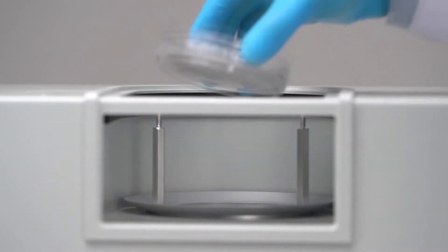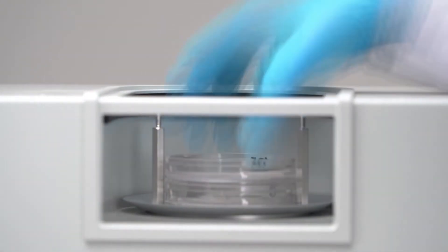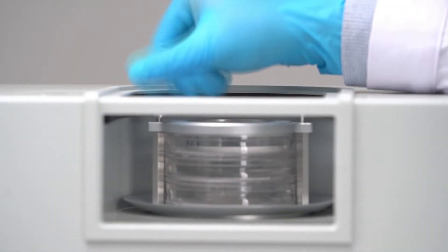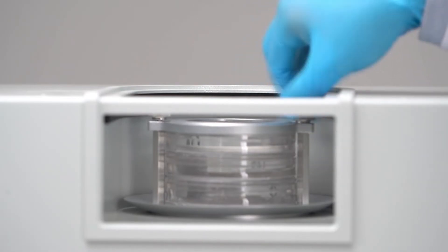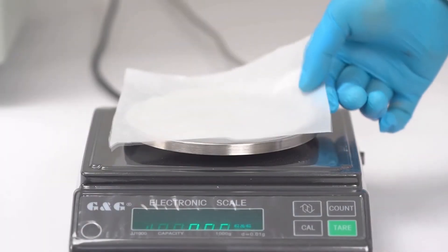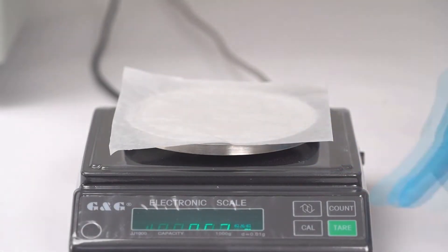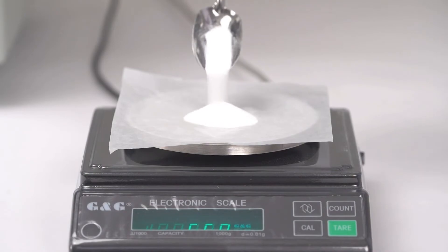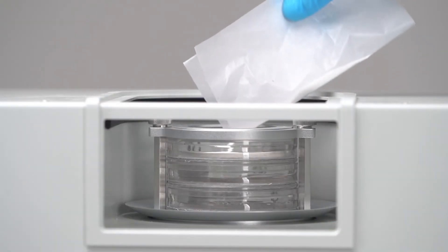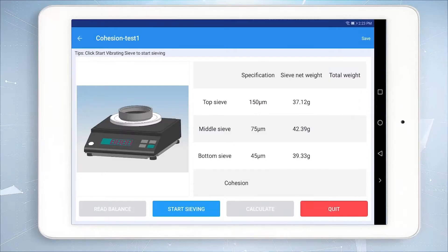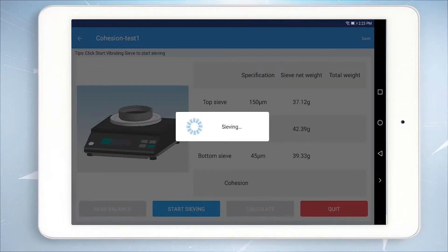Install the sieve and the stock pan after the measurement. Weigh 2 grams of sample with a balance and pour them all on the top sieve. The software will automatically calculate the sieving time. Click Start Sieving to sieve.